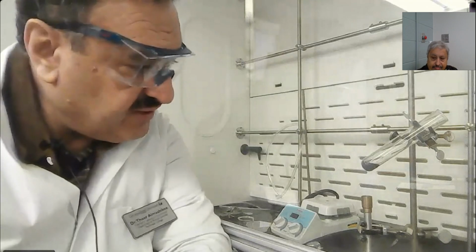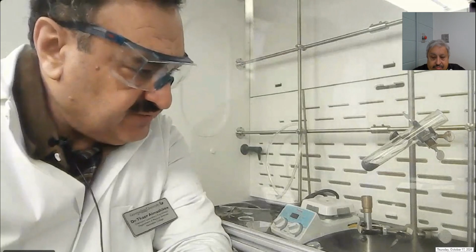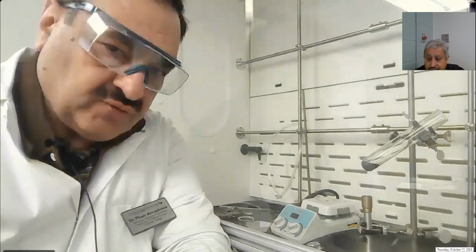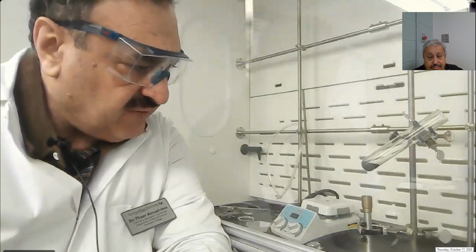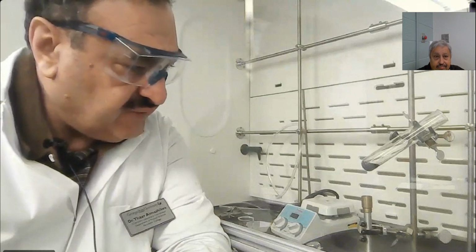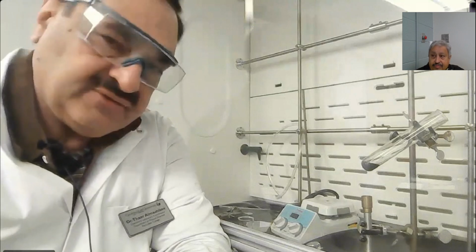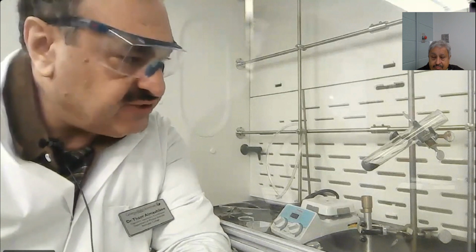Because of the time issue that I have, I will do only the first one and take the measurement, but you can do the second one and see the difference between these two. Again, if you have 0.5 percent difference, that's all. If you think you got more than that, you need to do the third one. After that, you need to do your calculations.